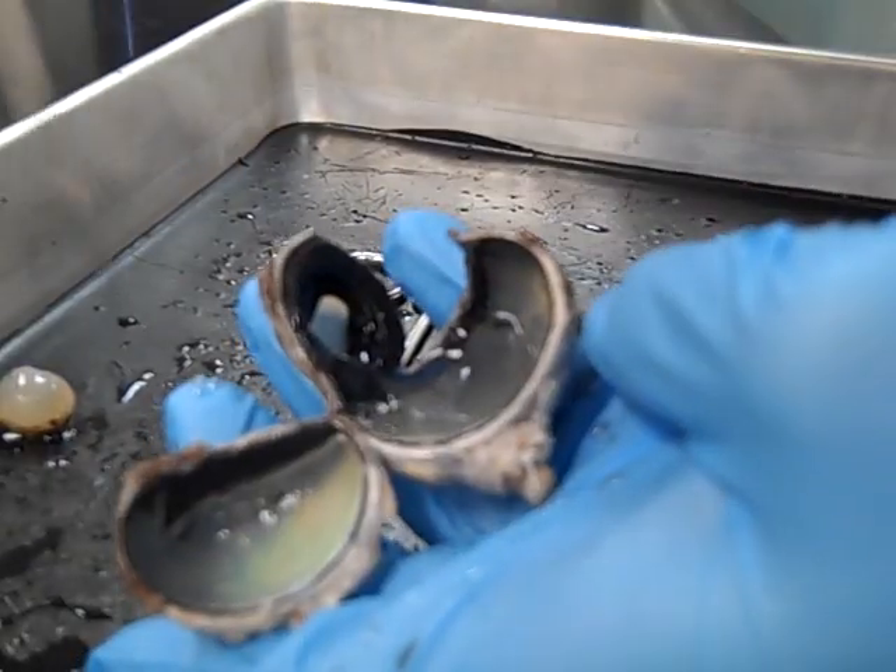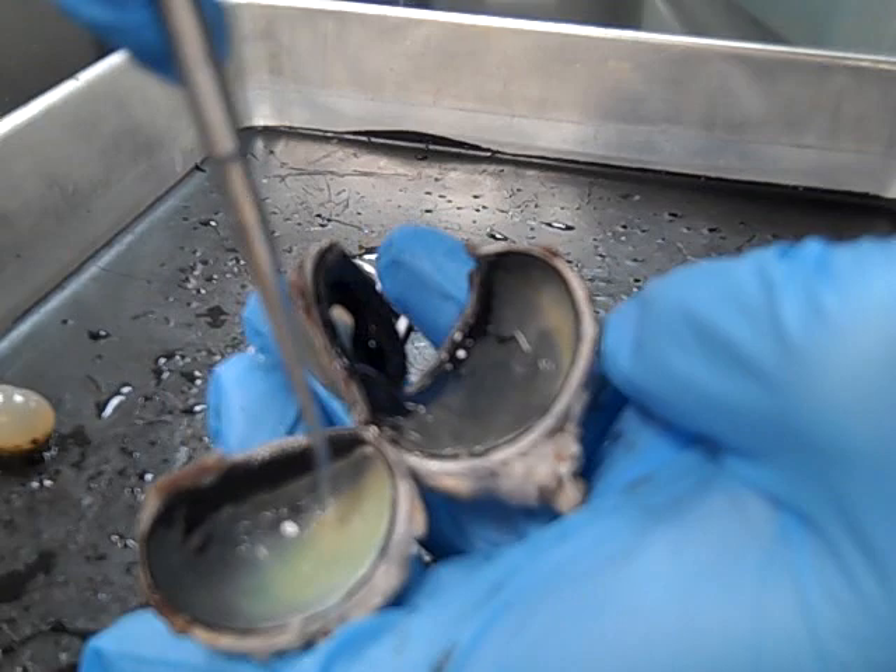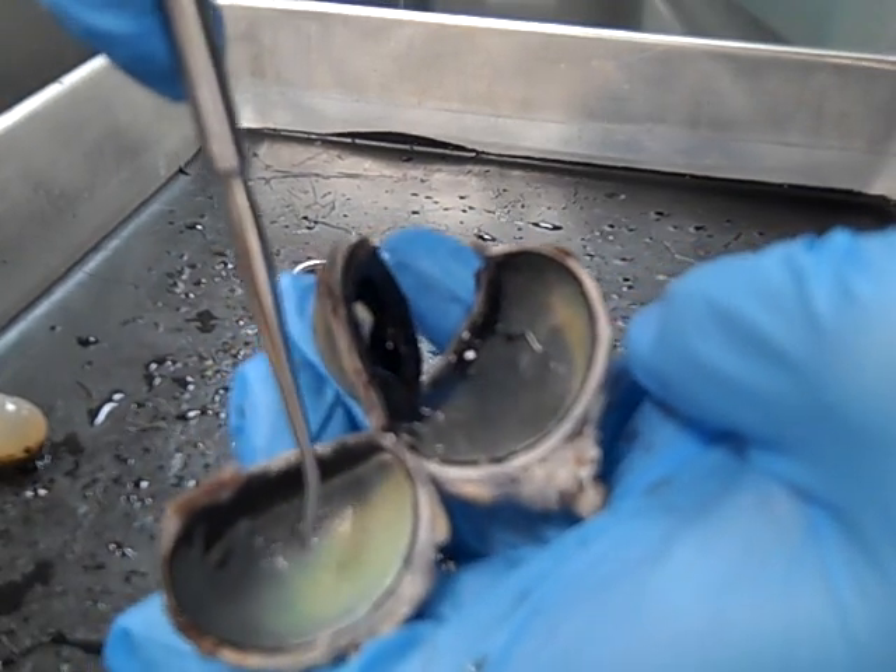On the inside of the eye, you'll notice this first layer right here — this light layer — that is the retina. That's what actually allows you to see. It contains those photoreceptors, the rods and cones.